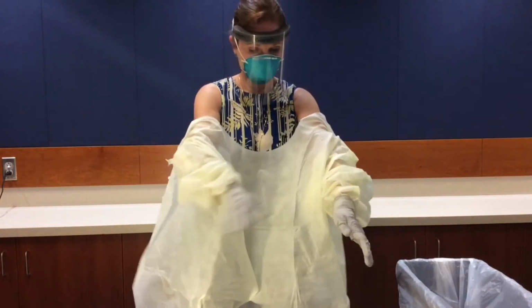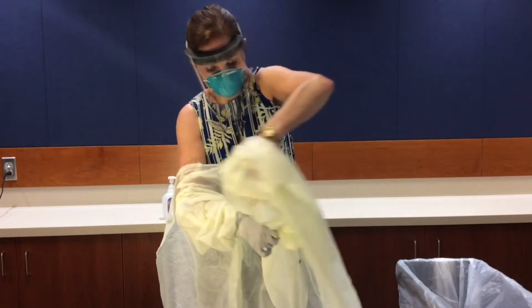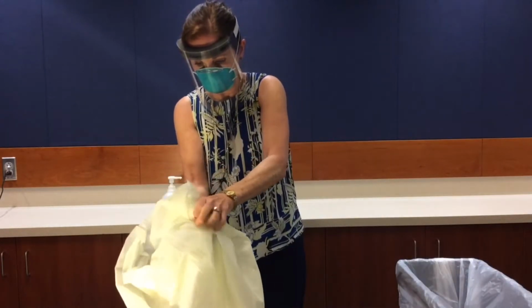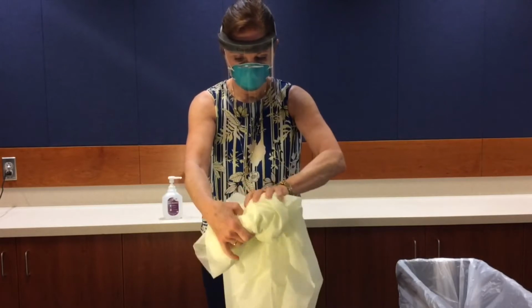Roll the gown into itself, peeling off your gloves at the same time, only touching the inside of the gloves and the gown with your bare hands. Hold the gown away from your body and discard in a waste container.